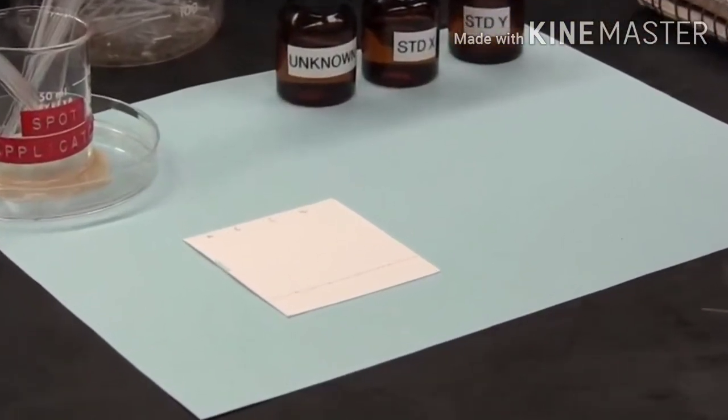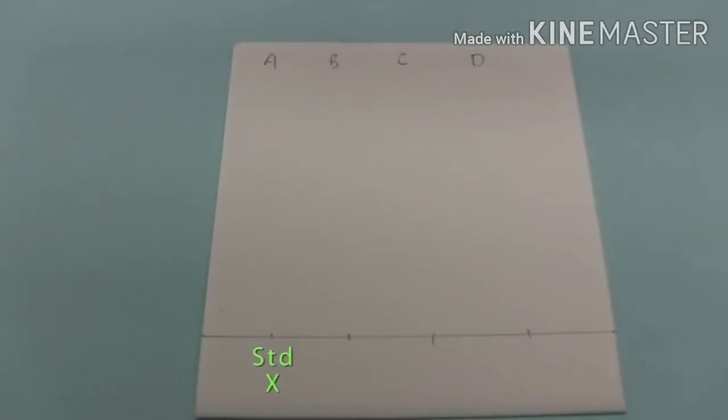And so with a clean capillary applicator, we apply a spot of the unknown in lane D. So looking at the spotted plate, we have standard X in lane A, standard Y in lane B. In lane C, we have a mixture of standards X and Y. And in lane D, we have our unknown, which is either X or Y, or a mixture of both. Let's find out the composition of the unknown.